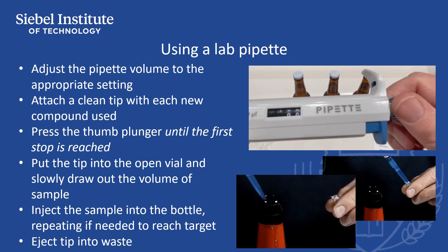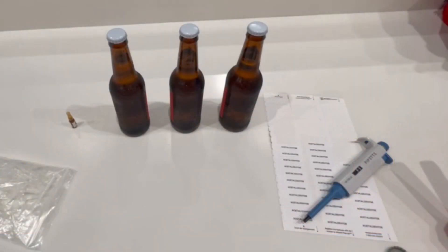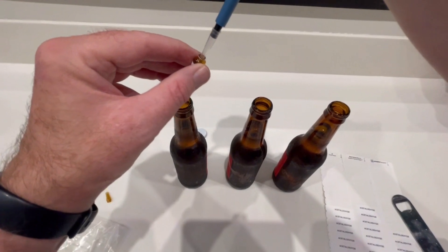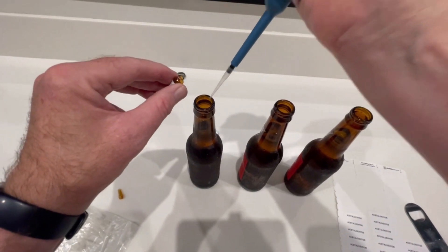With bottles of cold beer available, assemble all the goods you need to spike bottles, including a pipette with the appropriate volume range, pipette tips, a bottle opener, fresh unused bottle crowns, labels for the bottles, notes about how to spike the sensory compounds, and the selection of sensory spiking compounds. With the pipette set to 110 uL, the bottles uncapped, and the vial of sensory compound open, measure out the correct amount of sensory compound, counting each addition of spiking agent. When you are finished spiking, you can crown each of the bottles, making sure they are appropriately labeled.